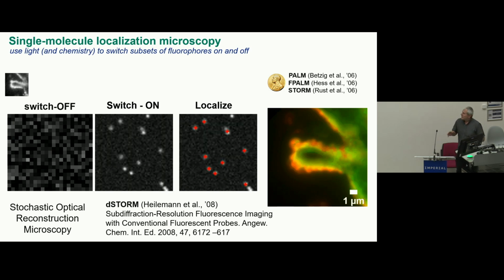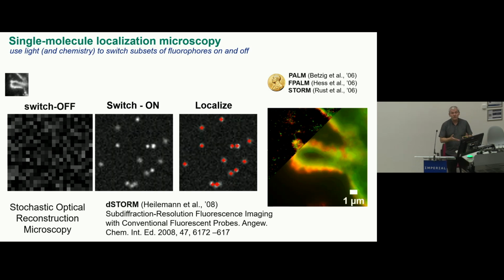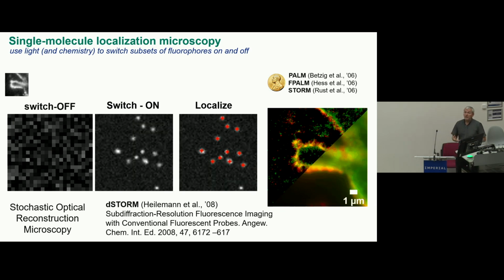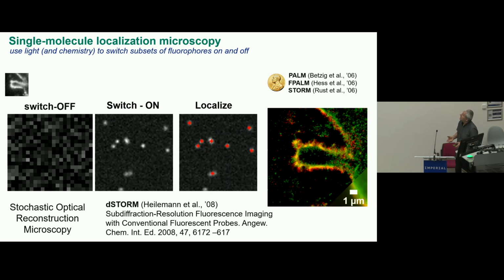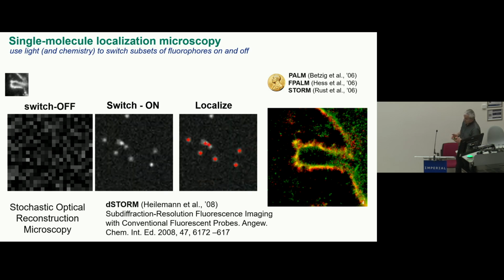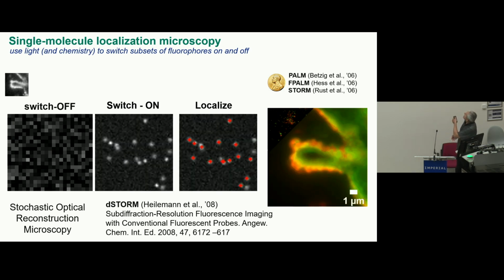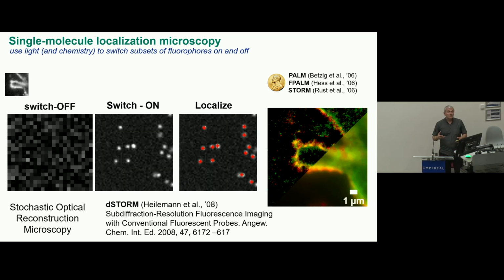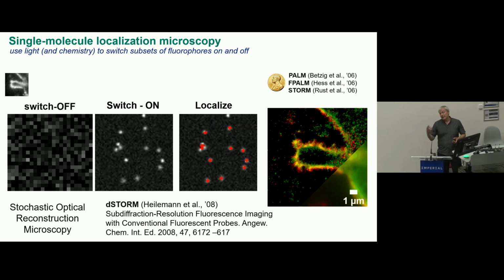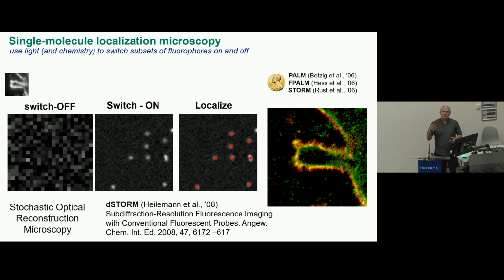At the moment you can use room temperature and document these quantum effects, let's say, at the electronic level. Then the technology is based on fluorescence microscopy. And what you can see here is a conventional wide-field fluorescence image. What the detector is observing is the average of all these fluorescent states.